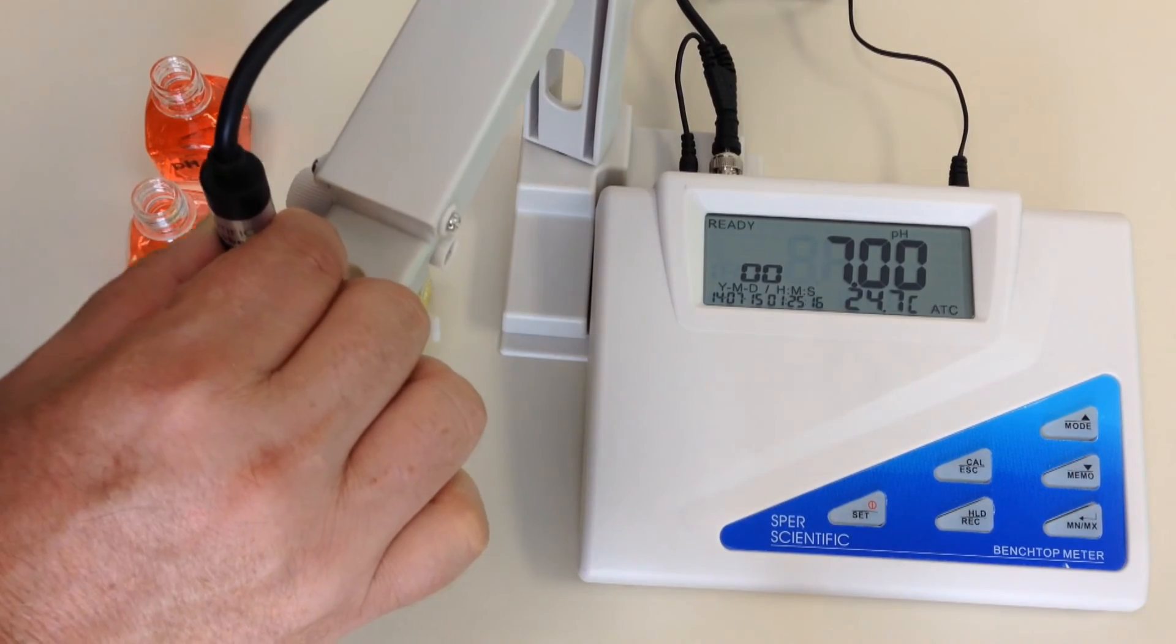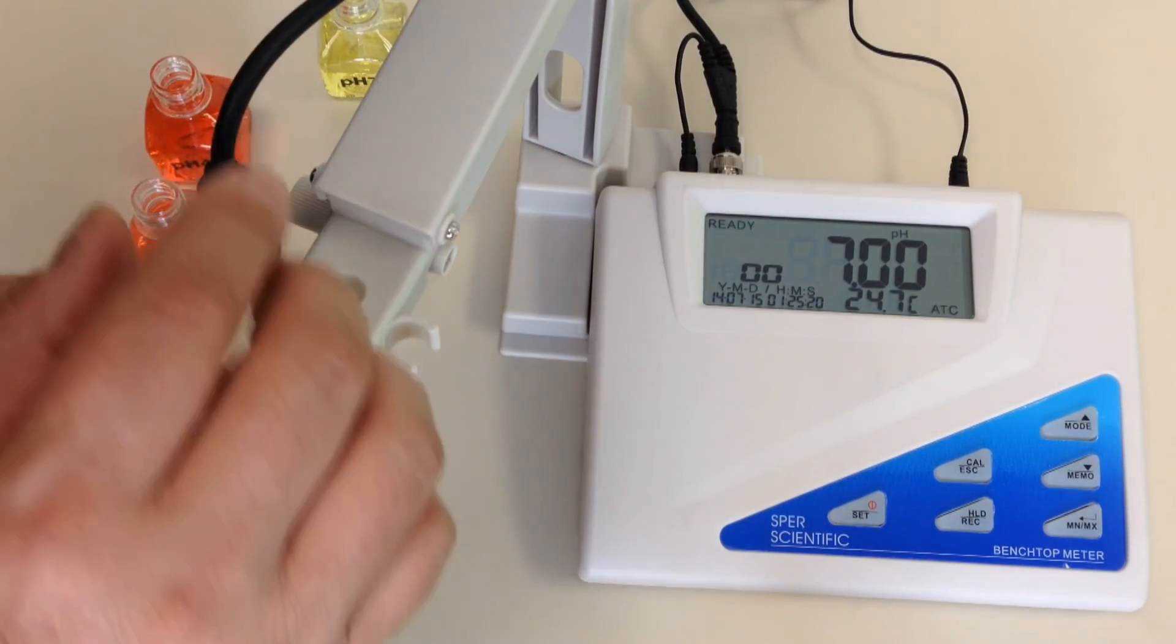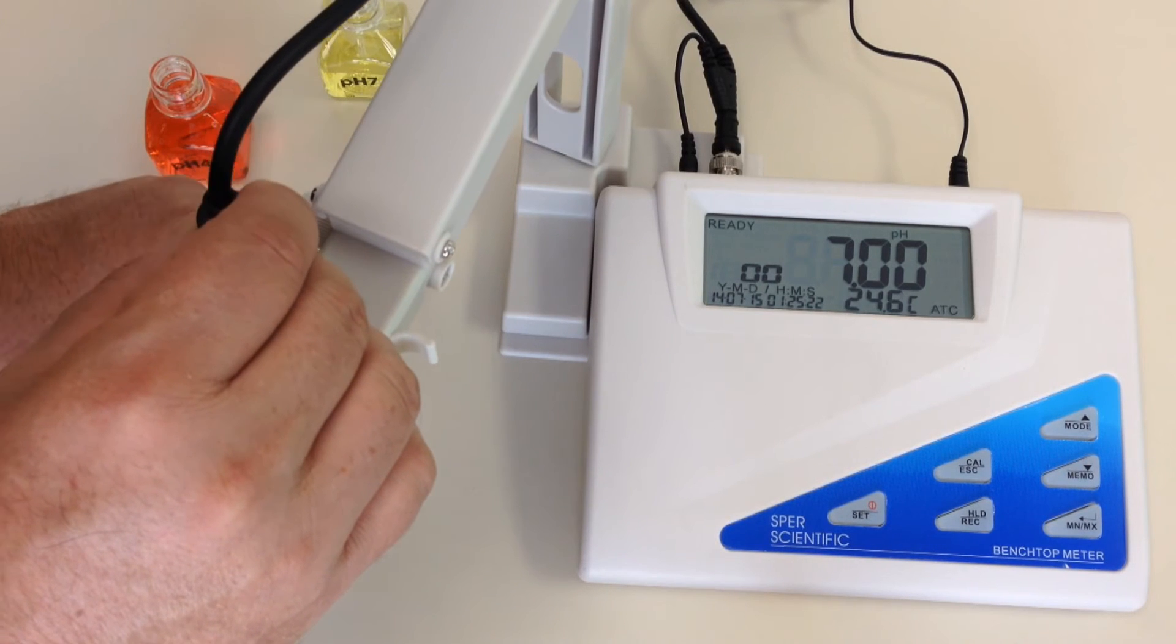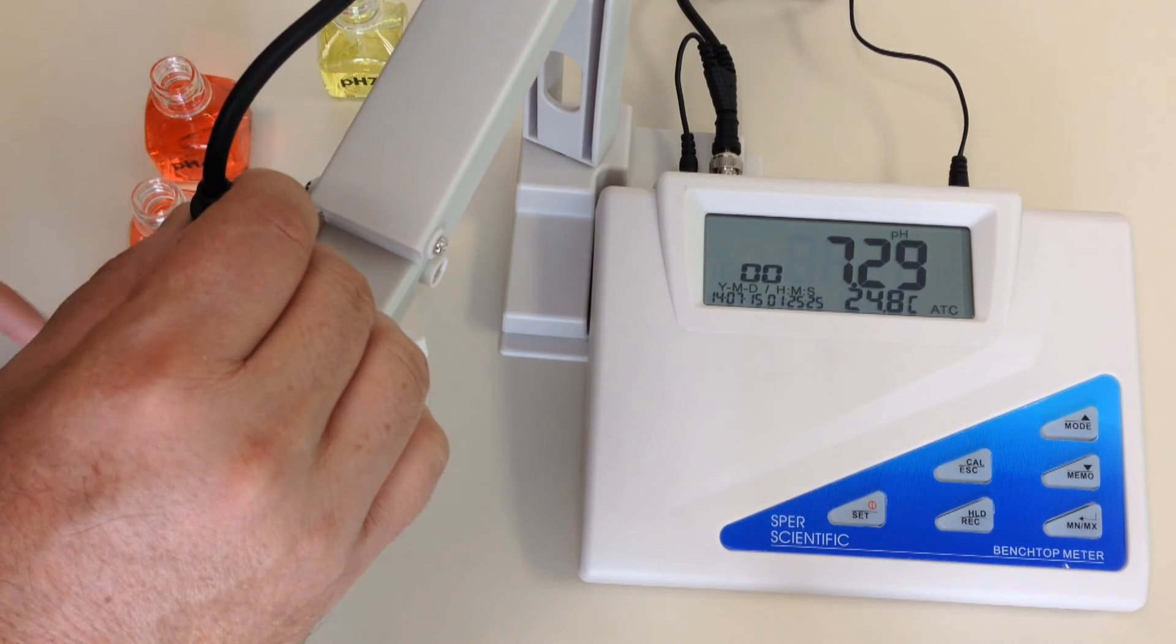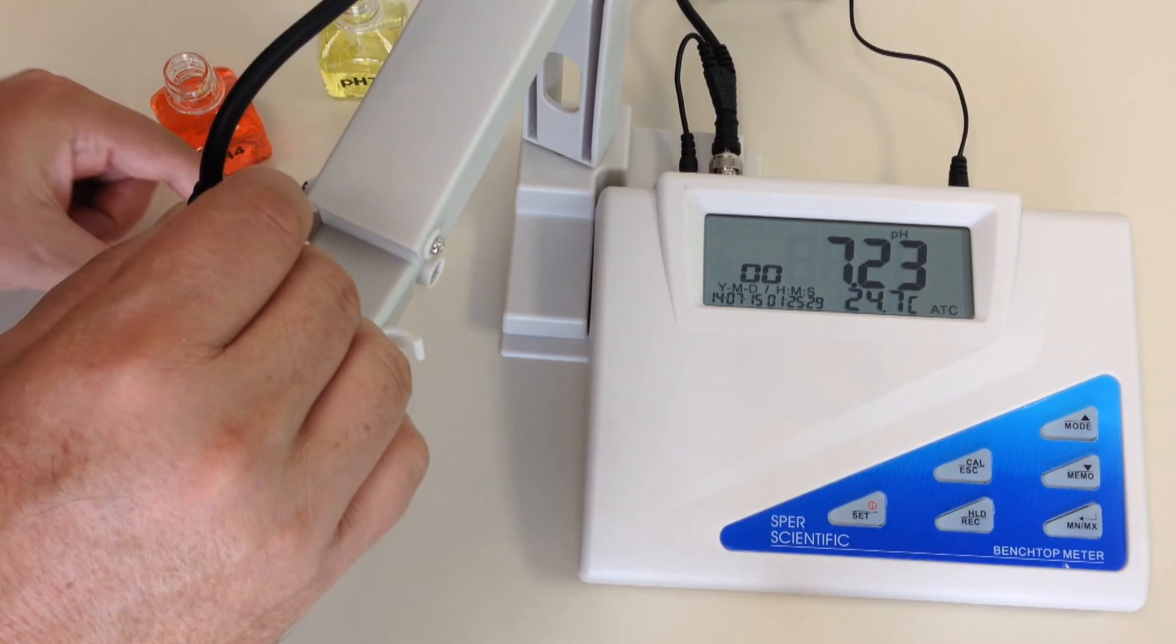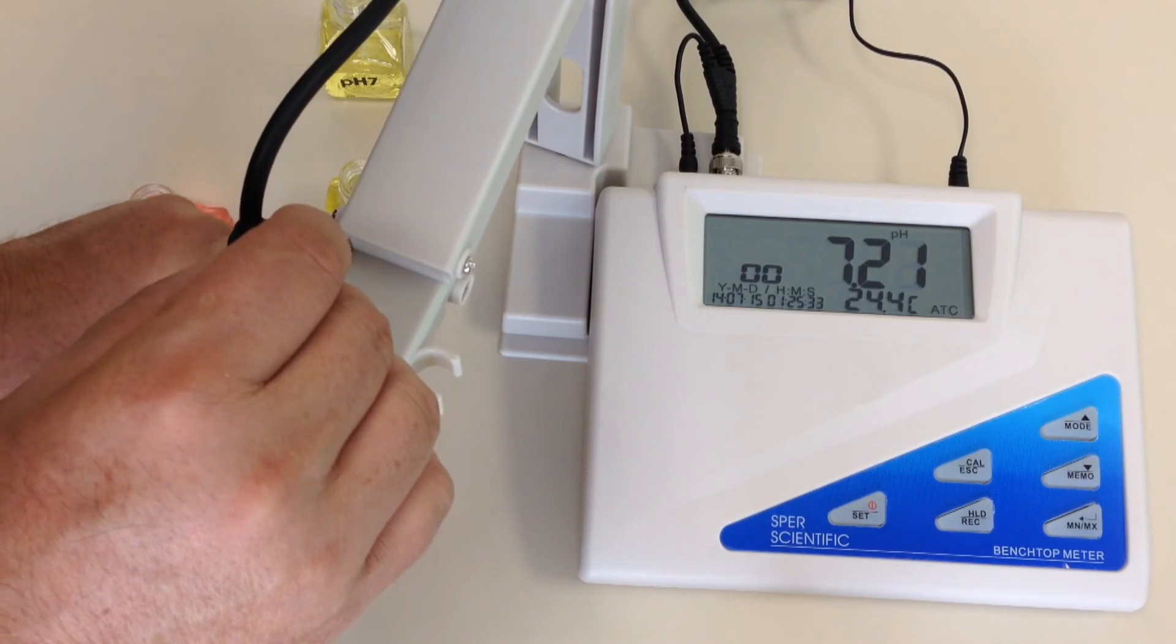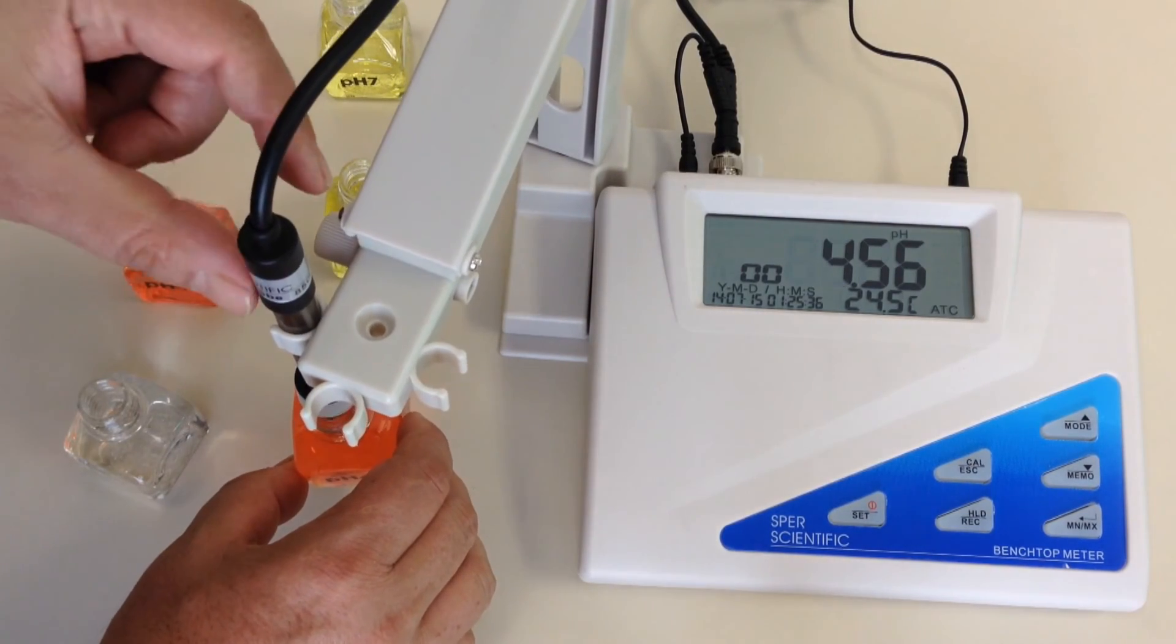So I am going to take this out, move my two solutions off to the side, going to clean off my probe using distilled water, going to put it inside the first pH 4, and now the actual solution that I am going to be calibrating.